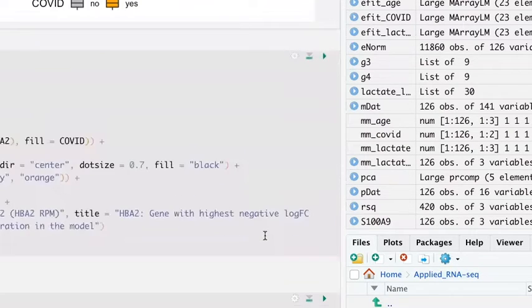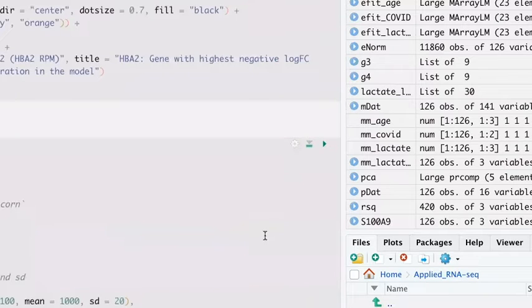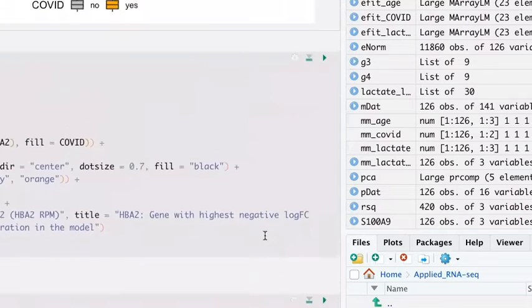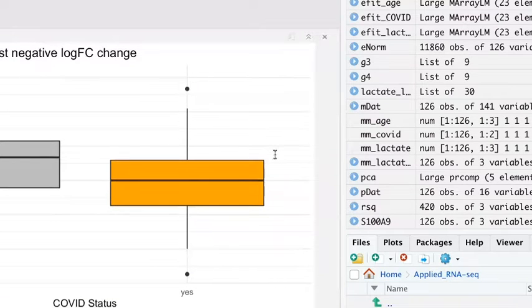Okay, cool. Actually, sorry, Nikita, there is one question on Zoom. It is: wouldn't you clean data of outliers before running analyses? Yes, you would. Sometimes, however, it is an iterative process. So sometimes you only come across these outliers when you're actually visualizing the data later on. So in this case, you would go back to your raw data or your normalized data.